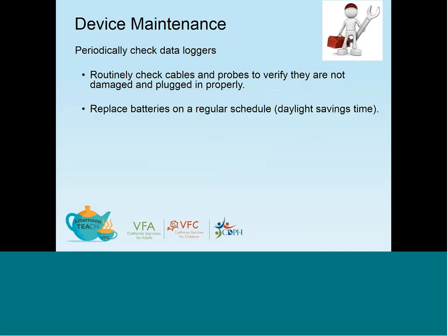And also, in case you're not aware, one of the specifications for having a digital data logger is that it does provide a low battery indicator on the device, and it should be on the digital display. This is going to be very helpful later on because we've had a couple of calls where staff have called in from a particular clinic because they're unable to download any readings or any information from their data logger, and that's because the battery has died and they forgot to pay close attention to the low battery indicator.